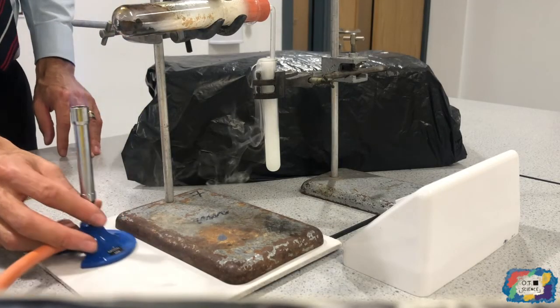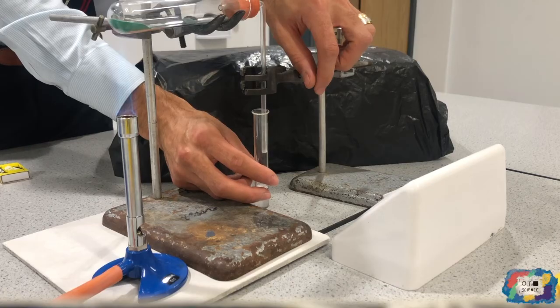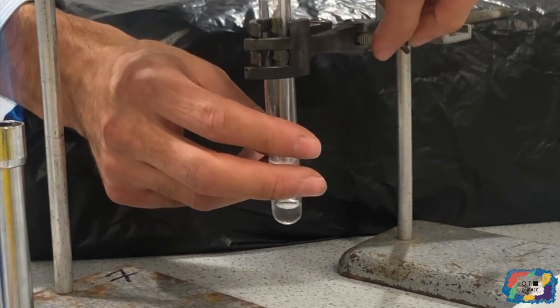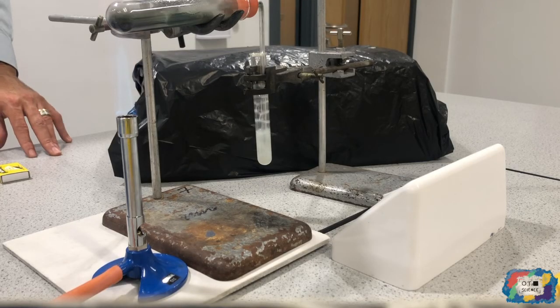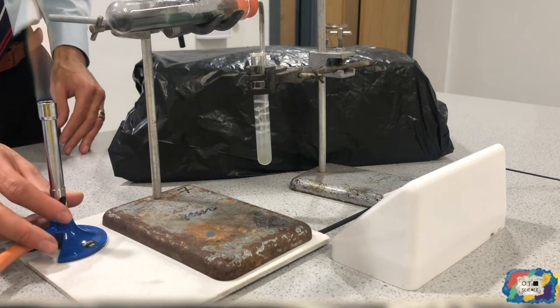Okay, I'm just going to stop it there. Three, two, one, time. Okay, I'm going to move that out of the way.